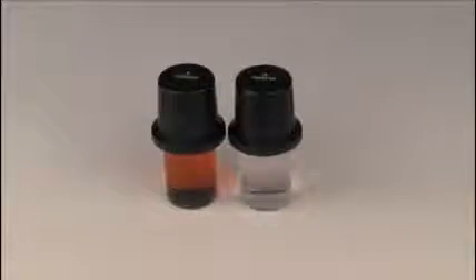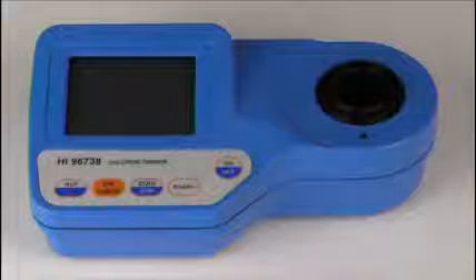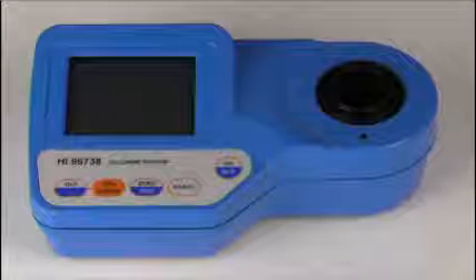In this video, we are going to demonstrate how temperature affects the reading of CalCheck standards in HANA colorimeters. We will be demonstrating with the HI-96738 portable colorimeter for chlorine dioxide.